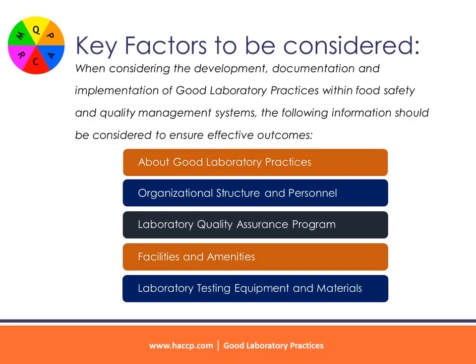Good laboratory practices development. When considering the development, documentation and implementation of good laboratory practices within food safety and quality management systems, the following information should be considered to ensure effective outcomes. About good laboratory practices: organizational structure and personnel; laboratory quality assurance program; facilities and amenities; laboratory testing equipment and materials.